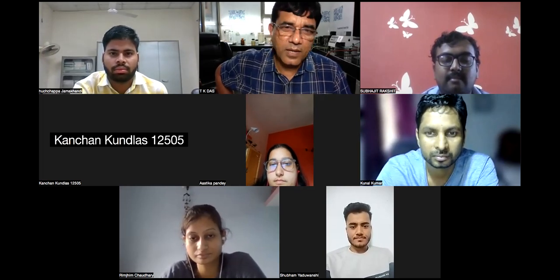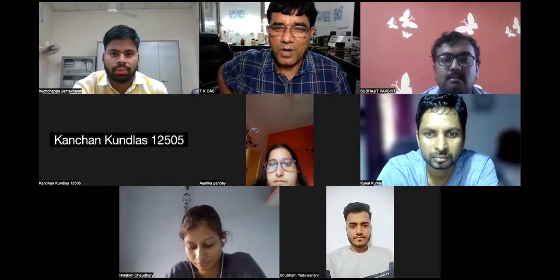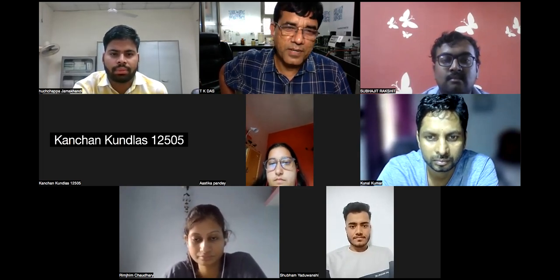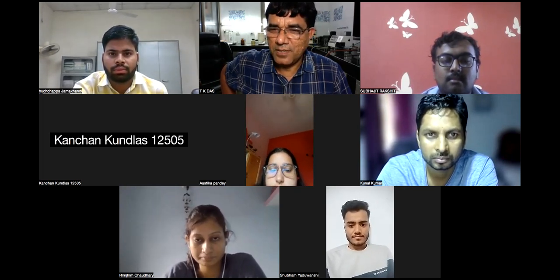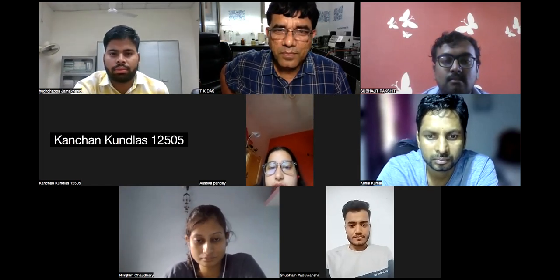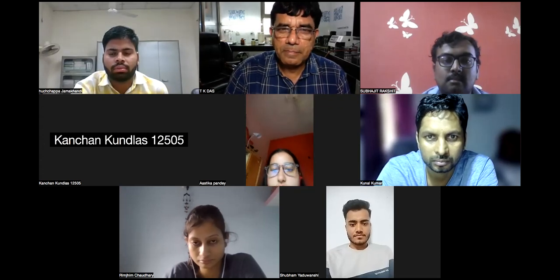Any point, anything you want to clarify in this practical, it is really a good time, the right time to ask. I can clarify all your doubts in this practical. Sir, if we are getting the ammonium sulfate in the first step only, then why are we going for distillation and titration? Because ultimately at the last also we are getting ammonium sulfate only.